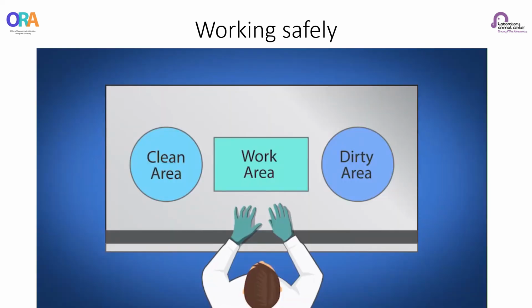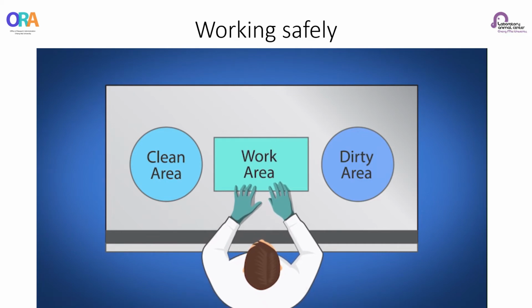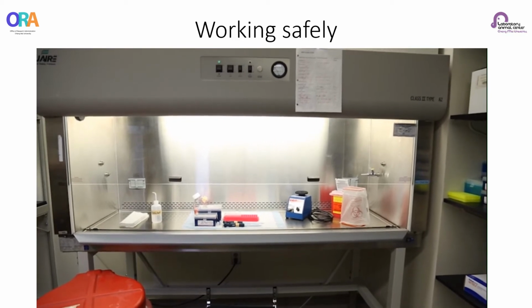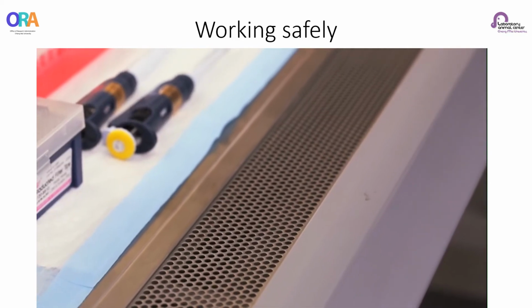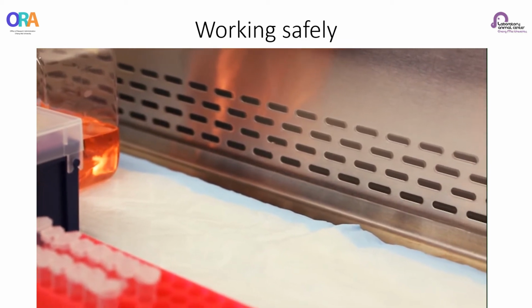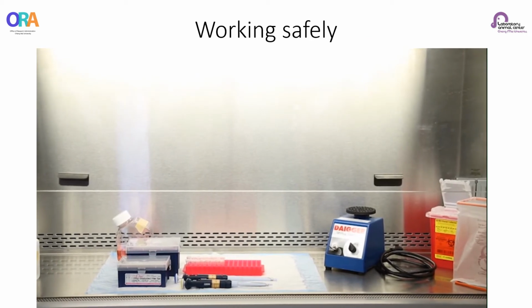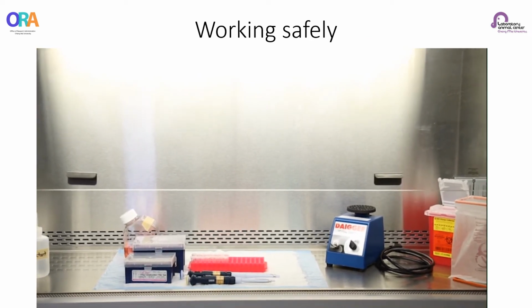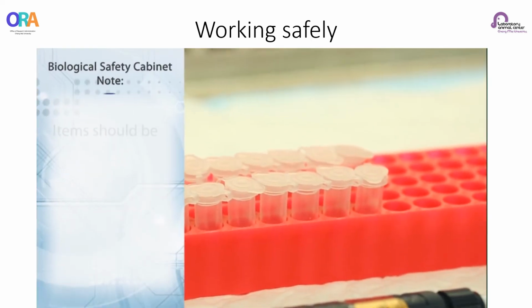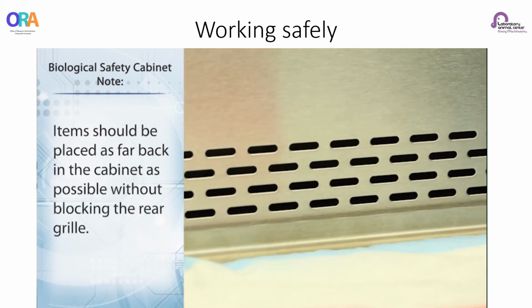Remember the clean to dirty principle and place clean materials on one side of the BSC and the biological waste and sharps container on the opposite or dirty side. In this video, we are demonstrating placement of materials for a right-handed person. Materials will be reversed for a left-handed person. Remember to keep the front and rear grills unobstructed to avoid disrupting the airflow in the BSC. Items should be placed as far back in the cabinet as possible without blocking a rear grill.